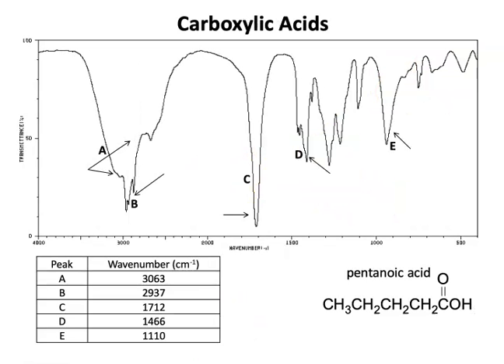A spectacular use for IR is to identify a carboxylic acid. I can always tell a carboxylic acid very quickly if you give me an IR, because there is this huge mound of junk. I don't care what's underneath that mound of junk. I don't care why it's a mound of junk. I just know that a mound of junk in this region usually tells us there's some sort of carboxylic acid there. And just like all these other carbonyl-containing groups, there should be a peak around 1700. Of course, if we really cared, we would ask why this is at 1710 and not at 1690 and all that other stuff. That'll come. Don't worry about it.